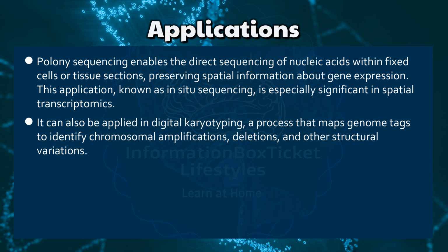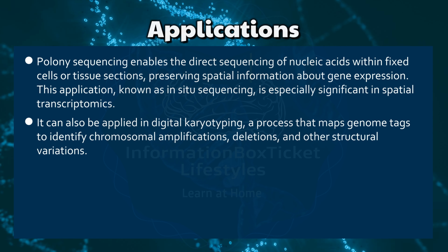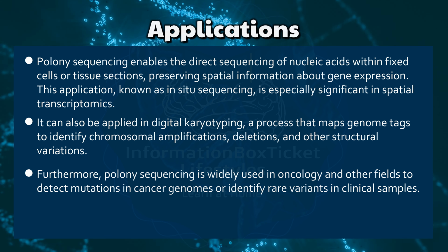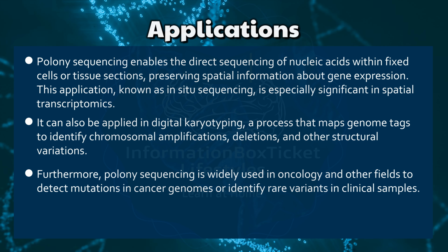It can also be applied in digital karyotyping, a process that maps genome tags to identify chromosomal amplifications, deletions, and other structural variations. Furthermore, Polony sequencing is widely used in oncology and other fields to detect mutations in cancer genomes or identify rare variants in clinical samples.